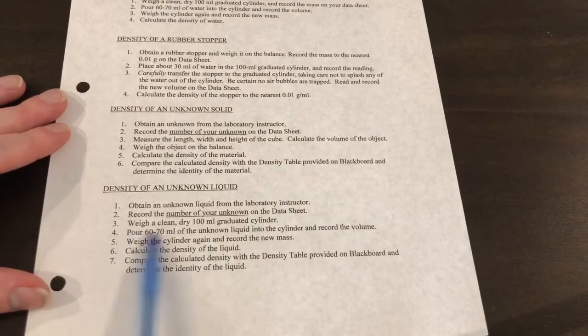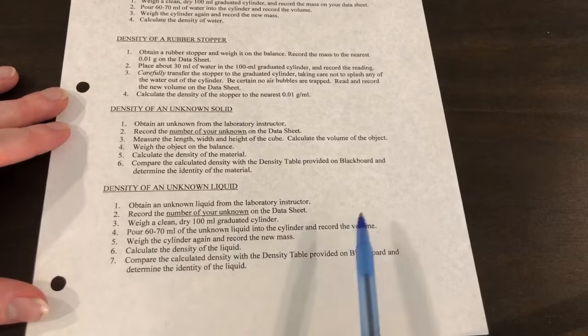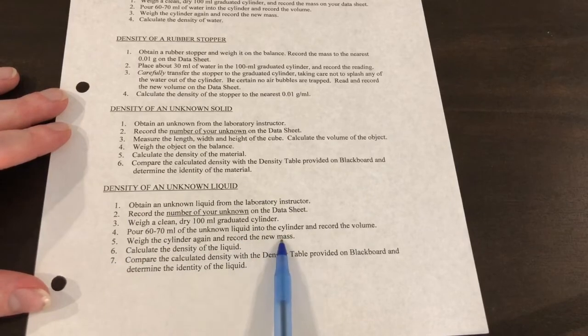We're going to weigh a clean, dry 100 milliliter graduated cylinder. Then we're going to pour 60 to 70 milliliters of the unknown liquid into the cylinder and record the volume. We're going to weigh the cylinder again and record the new mass after we've added the liquid.